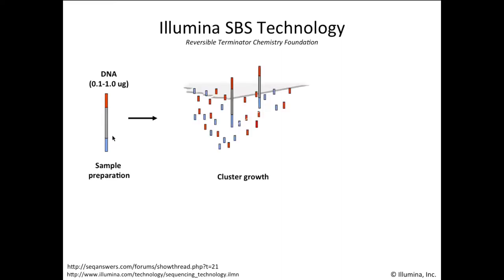And what you're doing is, you have essentially millions and billions of DNA fragments, all of which have different adapters on both ends. And what you do is you wash these DNA fragments over a lot of primers, and each primer is complementary to one of the two adapters. Okay. And the idea is that your DNA fragments are going to bind essentially to become fixed somewhere randomly onto a slide.